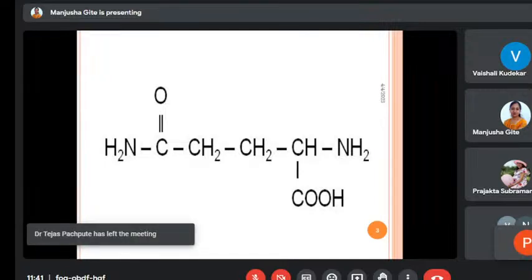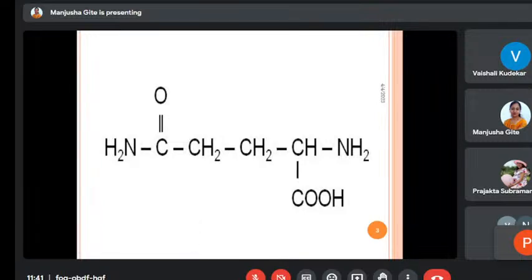What I told you, understood? Then you observe that there is an OH group. OH group always gives a broad peak. This is the first application of IR. Then I will go to the mass.